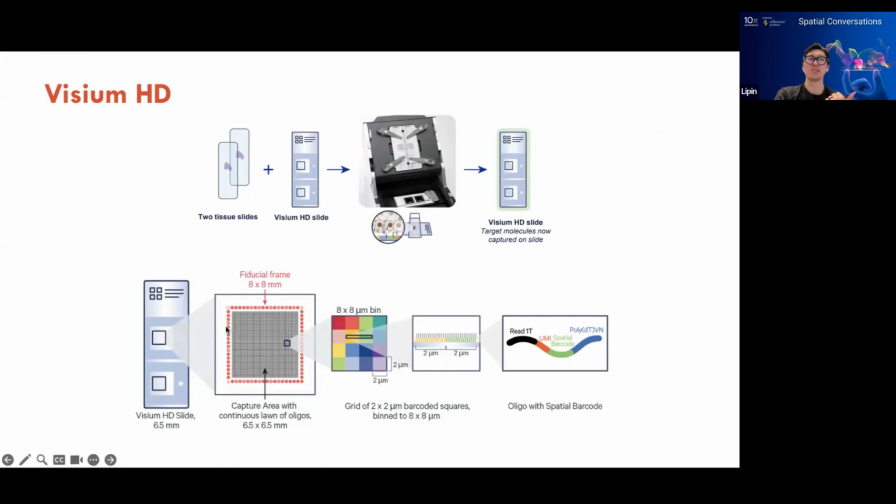And in the past, I've had some issues with spinal cord floating off in the process of one of the steps, like the cross-linking or the probe hybridization workflow, that deemed it unfeasible. I wasn't able to do that experiment because once your tissue floats off, you get dispersal of your transcripts. And so it's not really that good when you're trying to then visualize your image.